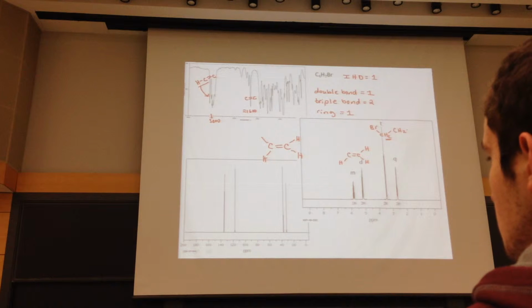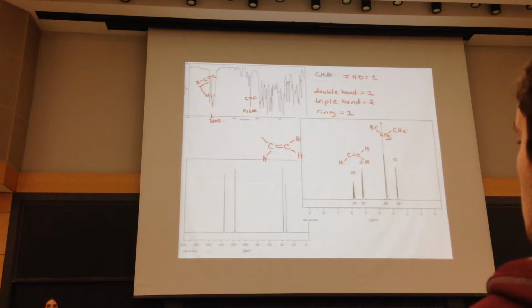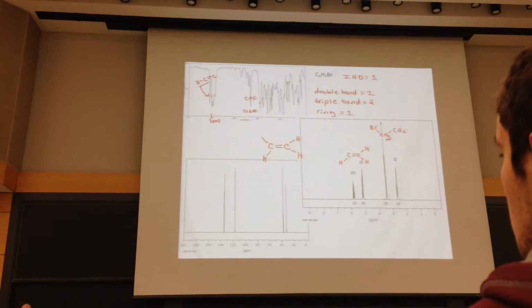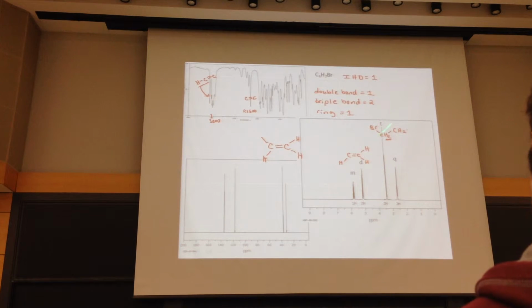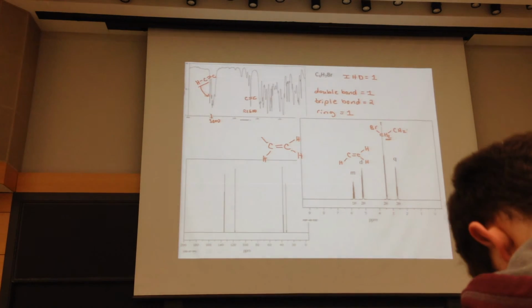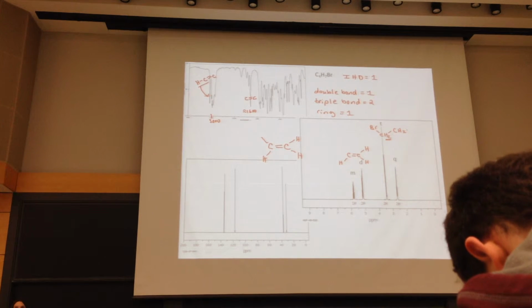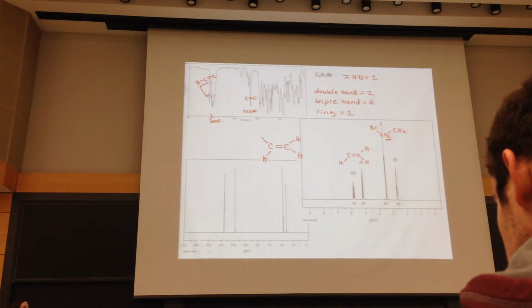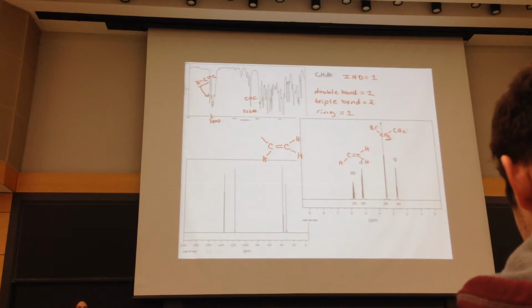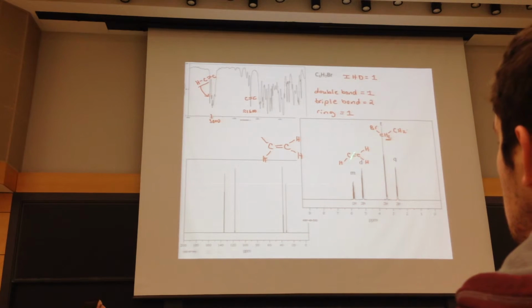Portion of the molecule. How many bonds do halogens get to be neutral? They only do one. We know this then has to be the end of our molecule. We can't carry on that way anymore. We know that this CH2 has 4 bonds. Nothing else can come off of it. We are next to a CH2. Well, that needs 1 more bond. If we're looking at the alkene, the CH2 on the right-hand side, 4 bonds, that's the other end.